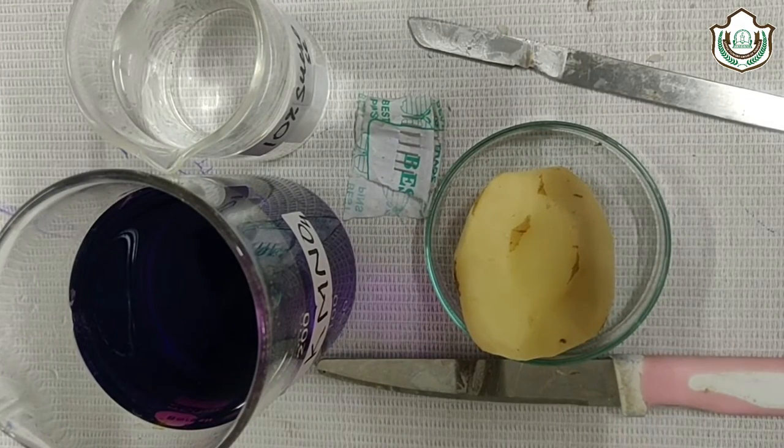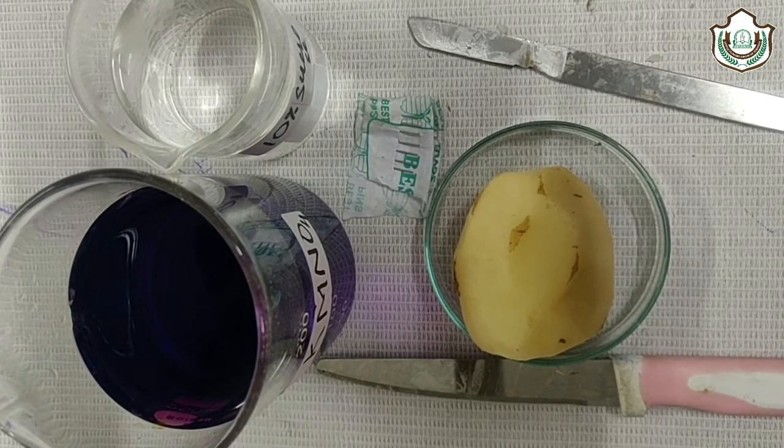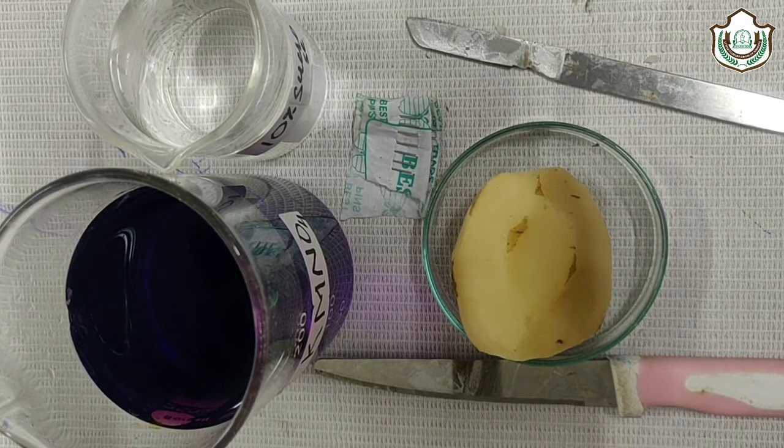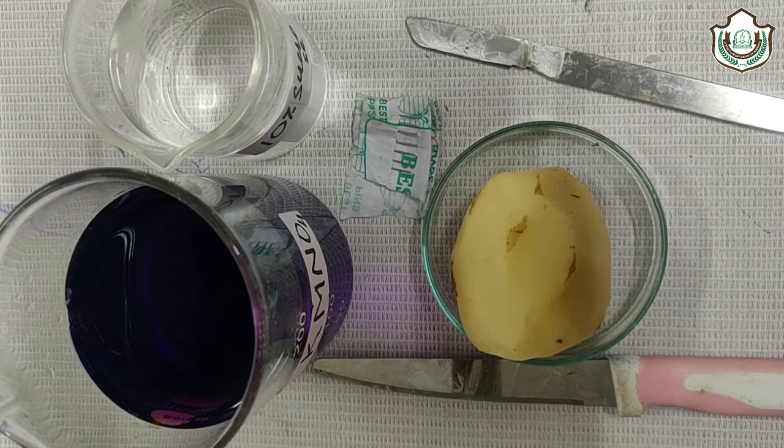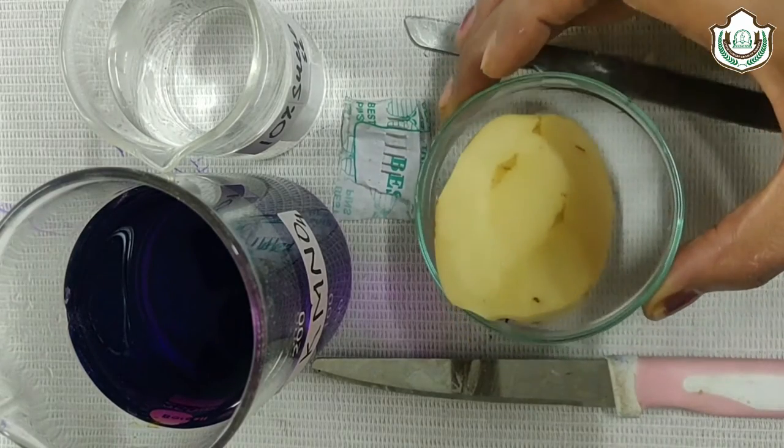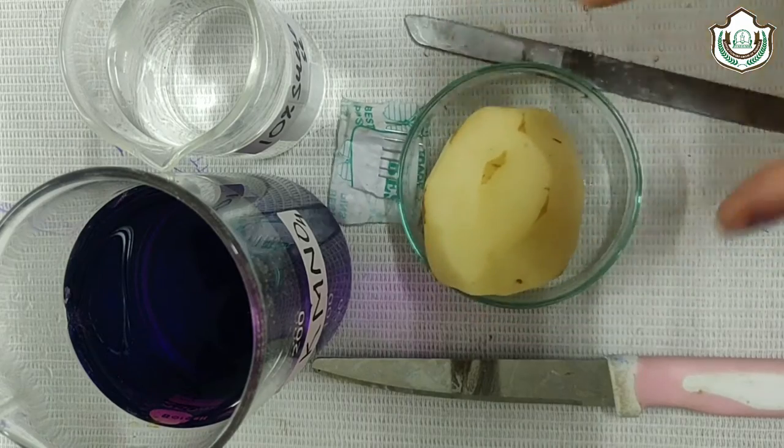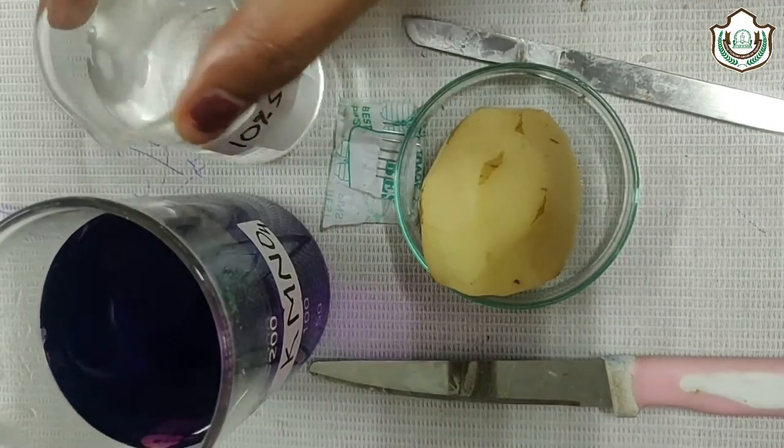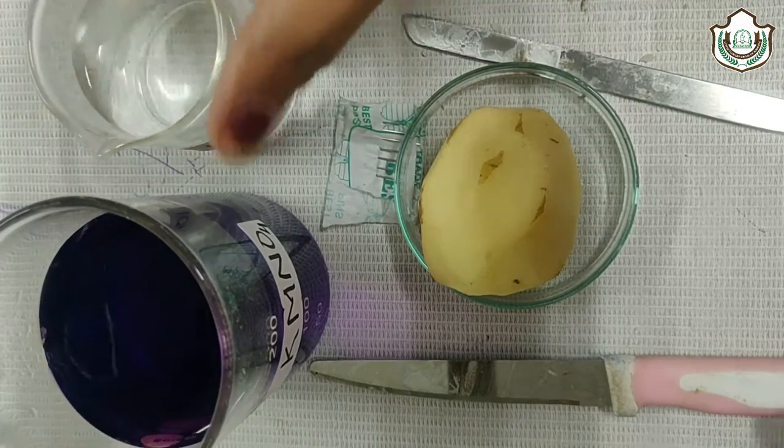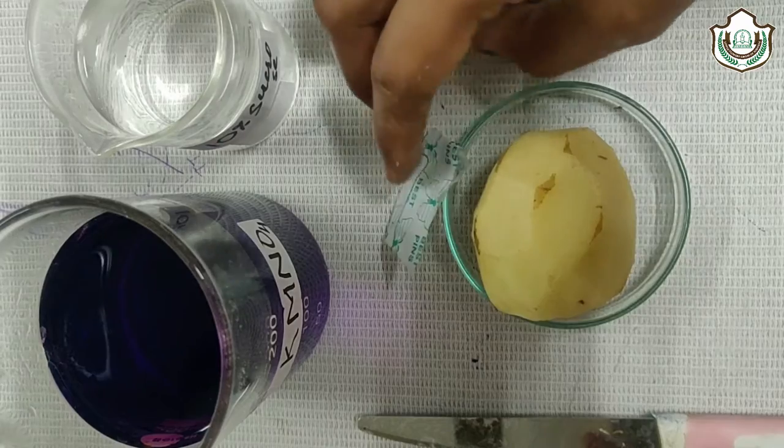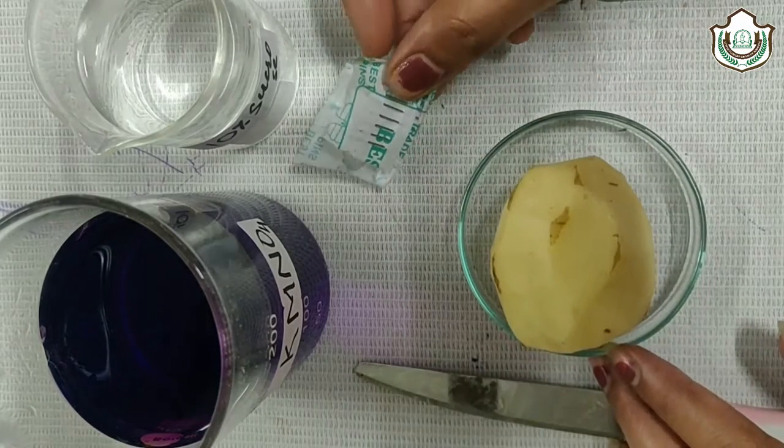Good morning all of you. Today we are going to perform an experiment to study osmosis through potato osmometer. For this, the materials required are peeled potato, potassium permanganate solution, 10% sucrose solution, knife, scalpel, and oil pen.